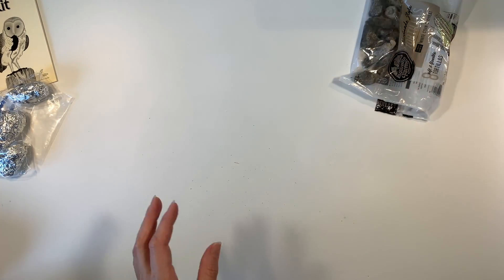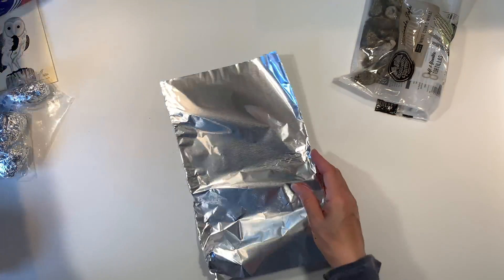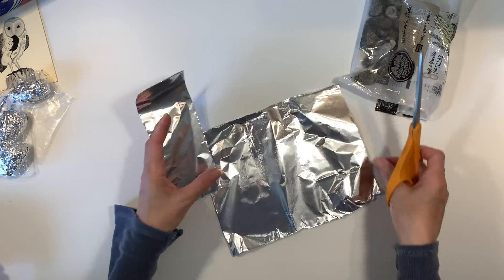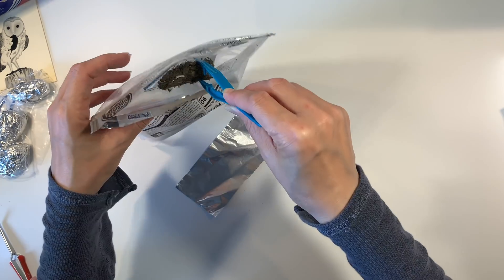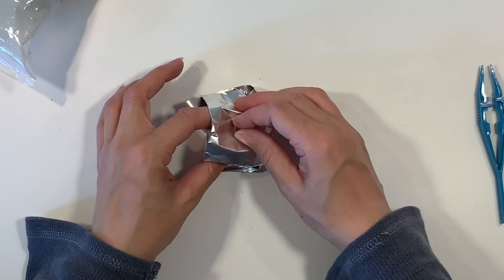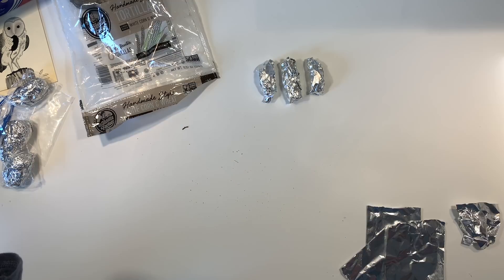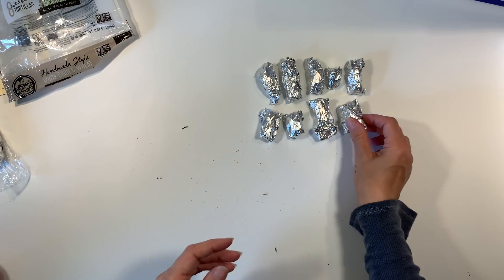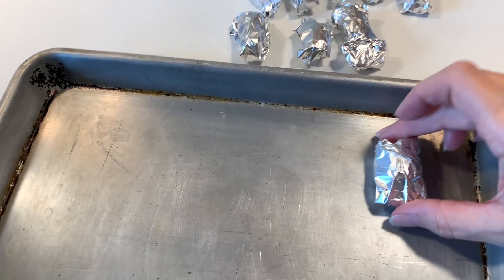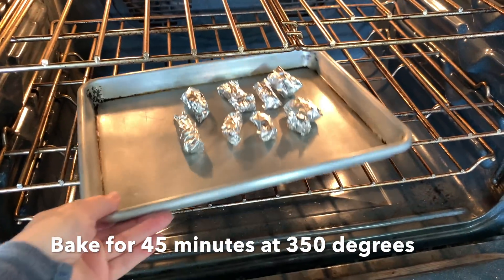A friend sent me some owl pellets that she had on her property, and I'm going to show you how to prepare them. We learned how to do this in one of the books for our unit study. You take your owl pellets, wrap them in aluminum foil, place them on a baking tray, and bake them in the oven for 45 minutes at 350 degrees.